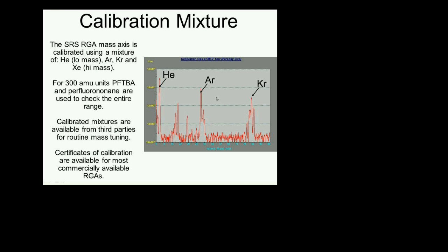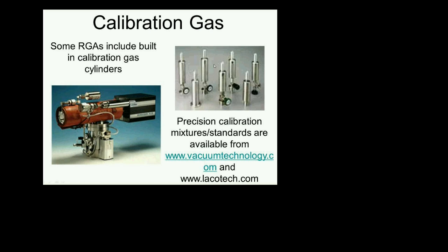And if I can give you a piece of advice, it is to buy one of these devices, particularly if you do a lot of quantitative measurements, and put it in your vacuum system. And on the left here is an example. In this product, the cylinder is already built into it. So the software will automatically ask you, do you want me to go and check if today we are the same as yesterday? And if you're not, it will tell you that it's not.